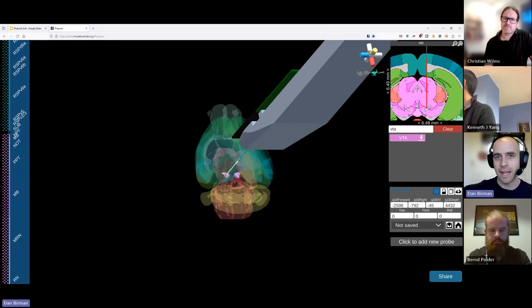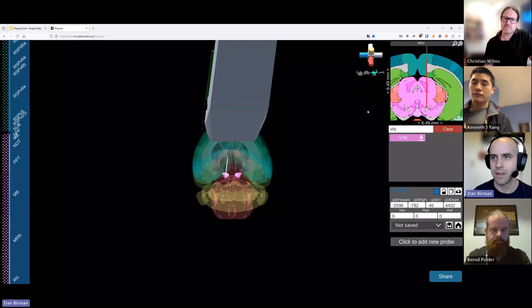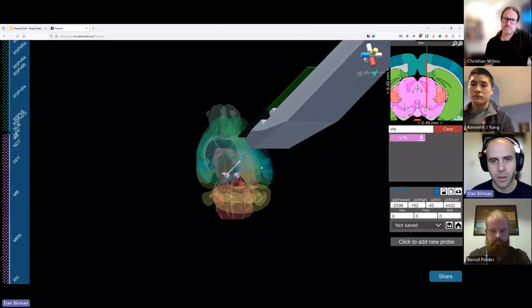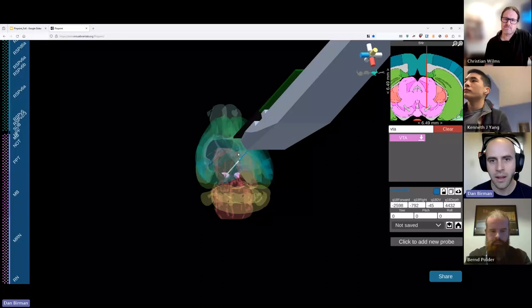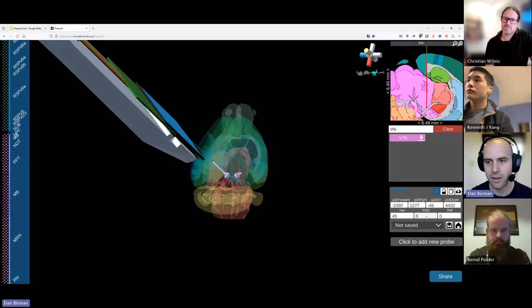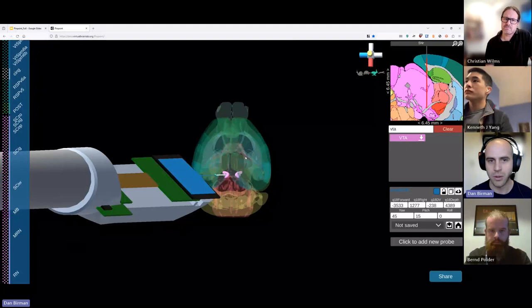This in-plane slice is looking from the front of the brain, so the right hemisphere appears on the slice. You can zoom in and out here to see more or less of the area. Let's say we're doing an insertion coming from the left — I'll use the yaw and pitch values here to rotate the probe. Maybe we're doing a rotation of 45 degrees from the side and pitched down by 15 degrees. This is a very typical kind of insertion you might want to do.